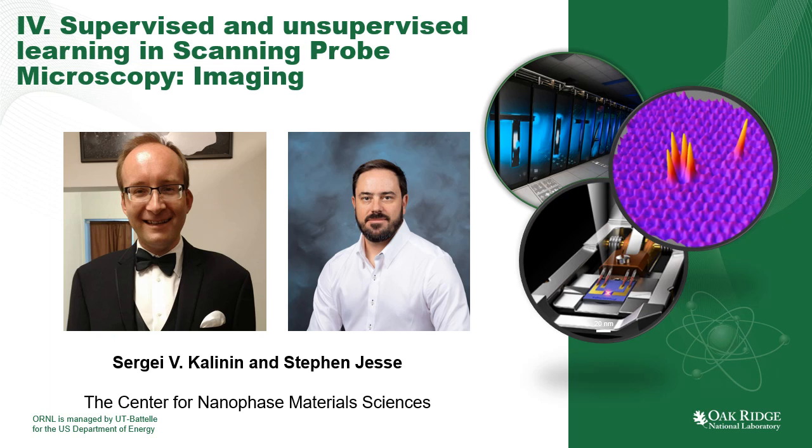Hello, and welcome to the fourth lecture on applications of big data, machine learning, and artificial intelligence in scanning probe and electron microscopy. In this lecture, we are going to talk about the applications of supervised and unsupervised learning in scanning probe microscopy imaging.